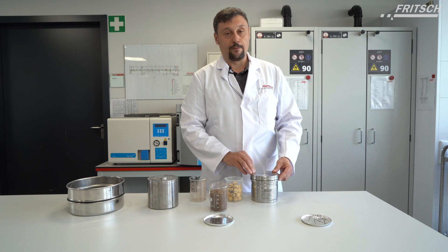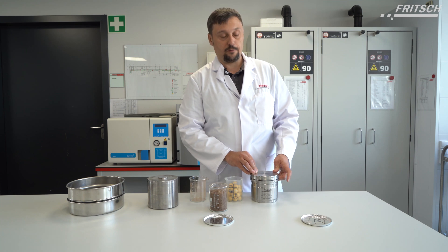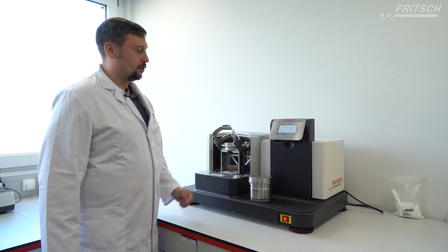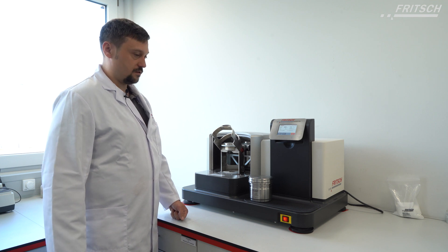We will place this bowl into the planetary ball mill system, the Pulverisette 5 Premium. Now we want to do the first test with a sample without balls, using 450 rpm, grinding for one minute.